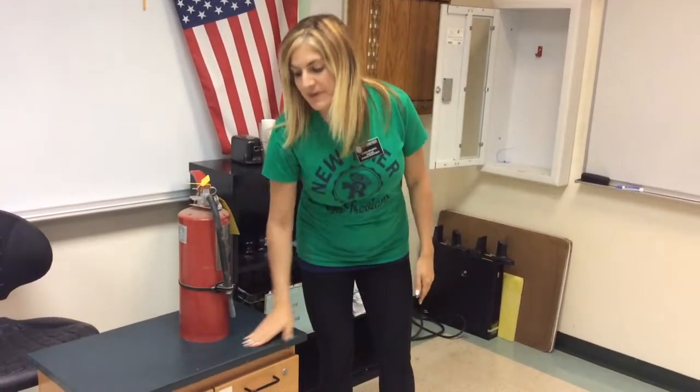Instead, for glassware that's on fire, let it sit on the countertop. Your lab countertops are fire retardant, meaning it slows down the fire. Warn everyone around you and step away.